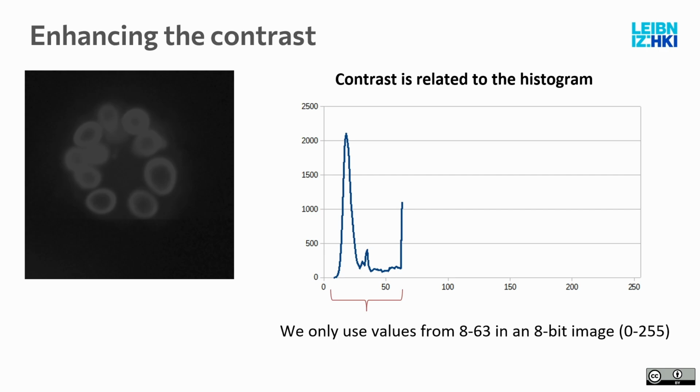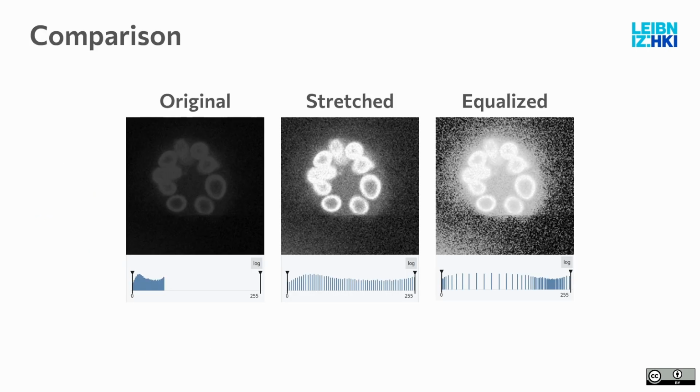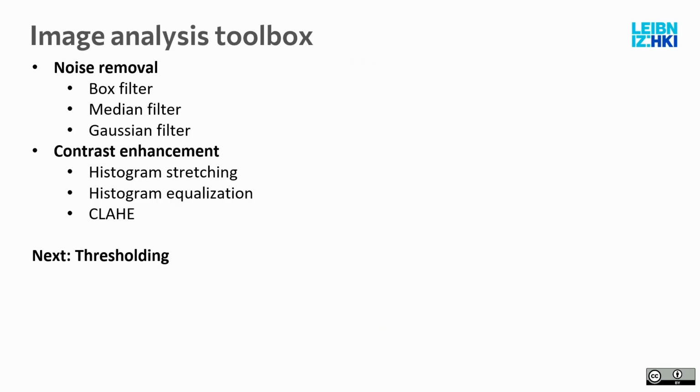You have to change it in the contrast tool, which does the same thing when you drag the slider in the image editor. It does exactly that in the background for you so you can see it. And this would do it programmatically, so our following algorithms that we want to work with for the analysis actually see it. We can't see it and the tool can't see it. That's basically the idea. So, thresholding is the next thing.